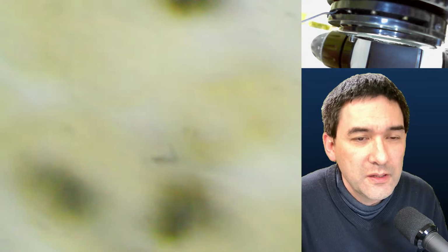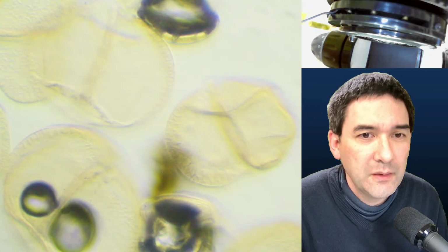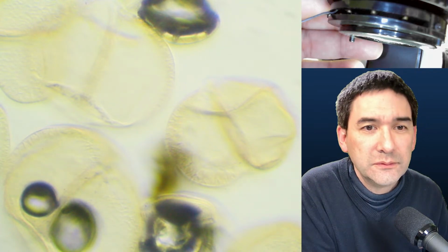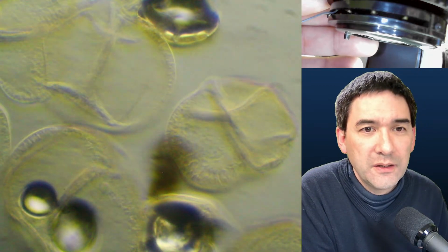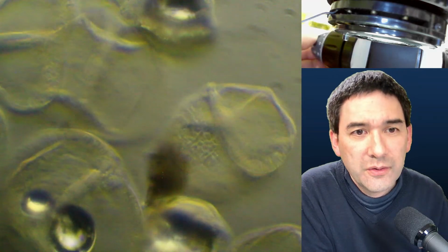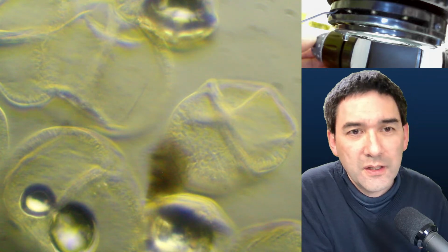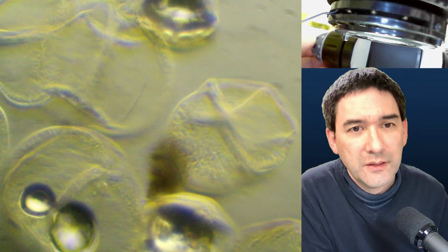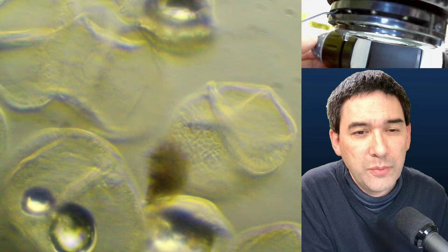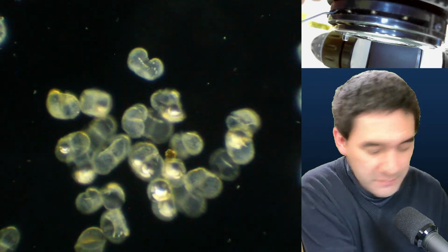Let's go up to 40 times. See how I always have to refocus a little bit. Look, there's another thing. Here we go again. Focusing. Now you see again the slight 3D effect, and again some air bubbles on the bottom. And last but not least, let's go back again here. I still have a few.